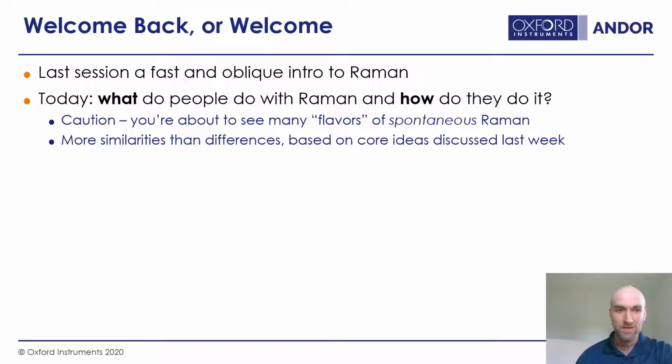Of course, I'm not going to talk about it, except for CARS, which is coherent anti-Stokes Raman. It's totally different almost. I mean, it gives a lot of the same information, but it's a pretty wild, ultra-fast technique. Maybe we'll get to that someday, but not for the intro course. So if someone says I do Raman, chances are you'll understand more or less what they're doing, unless they're doing some kind of stimulated Raman type measurement. Then all bets are off. Just ask them what they're doing. I'm sure they're happy to talk about it.